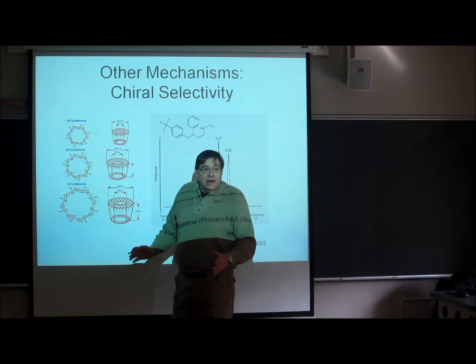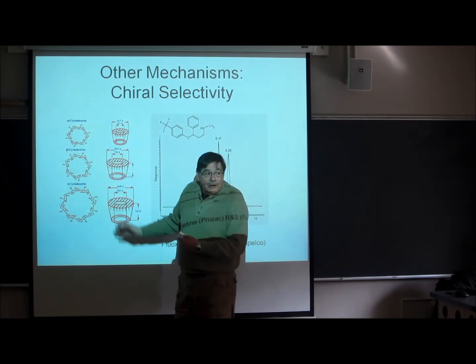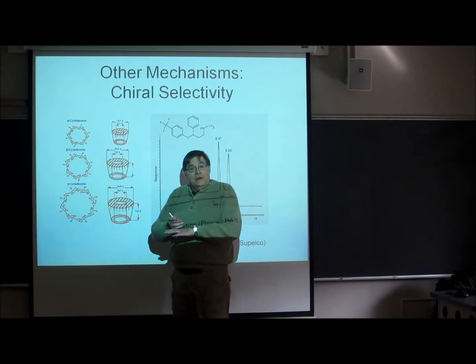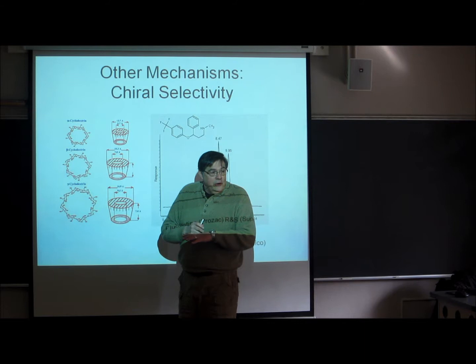While the left says, I'm not comfortable here, this is completely wrong, I'm going to move on, which comes out the detector early. You follow? So what you do is you make an optically active phase which will attract or not attract the different stereoisomers that are coming out, R and S.